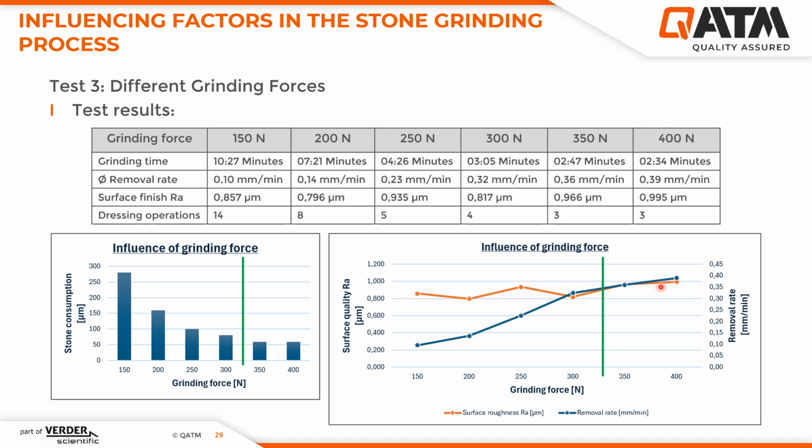Basically, when changing the grinding forces, it must always be kept in mind that the abrasive pressure is also increasing the plastic deformation in the sample material. These deformations must be removed in the subsequent grinding and polishing steps in order to be able to analyze the true material structure. Therefore, be careful, especially when increasing the grinding pressure. Unfortunately, I did not have the opportunity to measure the direct influence on the material structure through further analysis methods.